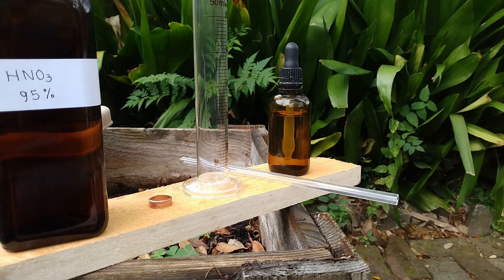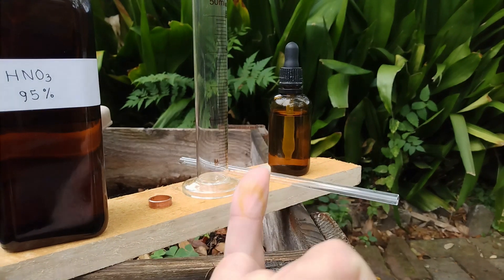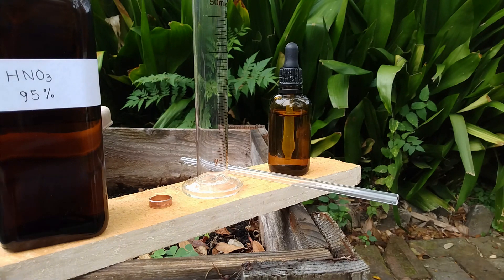Now you see what happens to the gloves when you pour acid on them. What would happen if I directly poured some acid on my fingers? Well, it doesn't hurt that much. When you have some nitric acid on your hand, you have plenty of time to go rinse it off — it won't hurt if you do it within a few minutes, but it leaves some yellow marks that take about three weeks to go away.